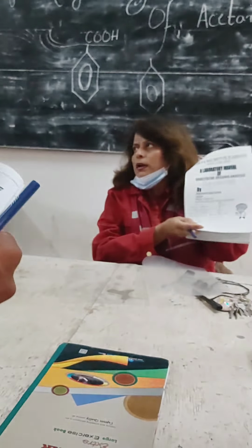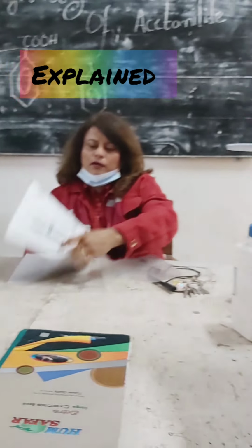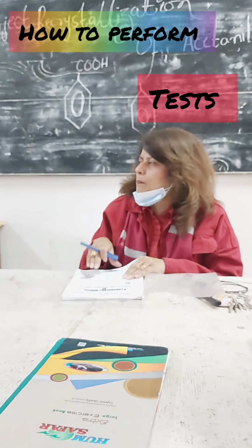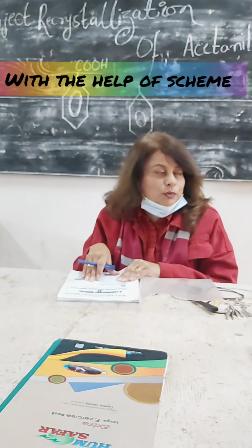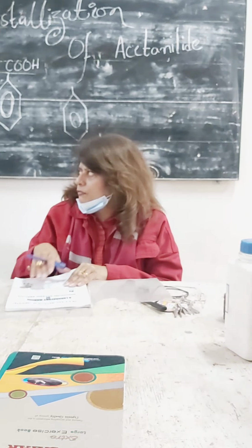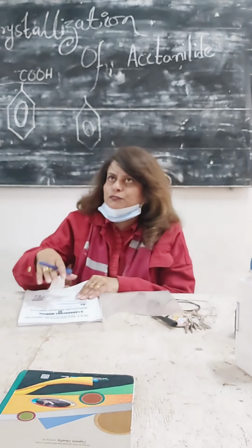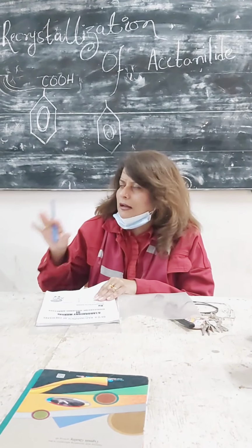So that's it. For the identification of known unknown organic compounds, this is the scheme, right? This is the first page. In the first few pages there are laboratory precautions which you are supposed to take, and the glassware which you are going to use, a few things which you are supposed to read. This is for the students' own personal knowledge. So you just go through that.